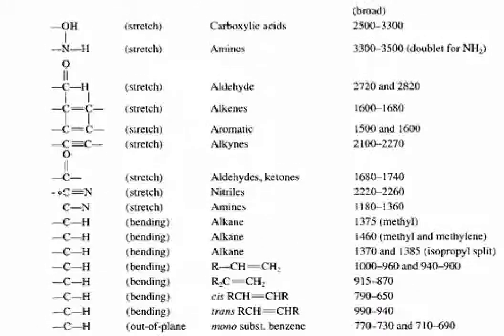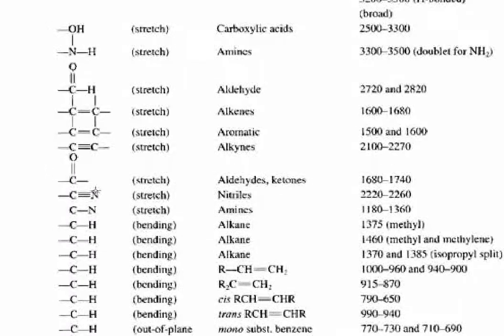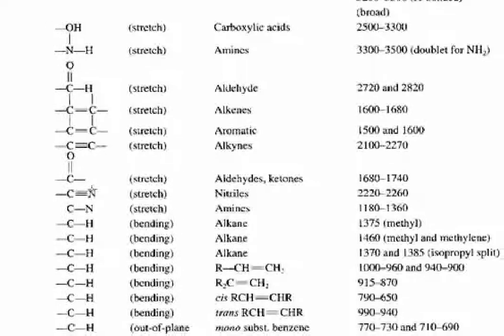Right. Next entry we come to, the carbonyl C double bond O stretch. The average stretching frequency is from 1680 to 1740. Now this one's very important because if you have a carbonyl group of an aldehyde, ketone, ester, or some other functional groups, the peak that's produced by that stretch is one of the biggest in the entire spectrum. It's very prominent.